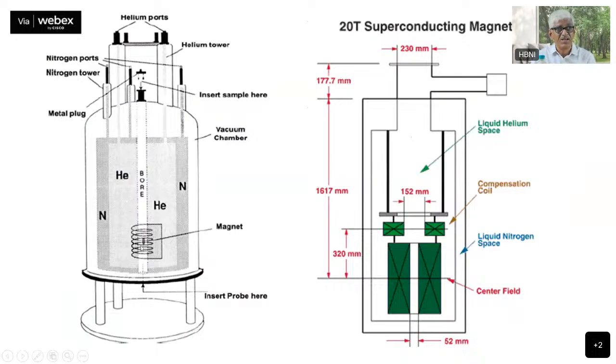Therefore, you have to create a coil which can go into the superconducting state. This requires certain kinds of materials. Niobium tin is one such alloy. Niobium titanium is another kind of alloy, and that is used to make these coils. And you induce current in this closed coil by using what are called induction procedures. The magnet charging is an important process in itself. Okay, magnet charging, you induce current into this coil by this process of induction.